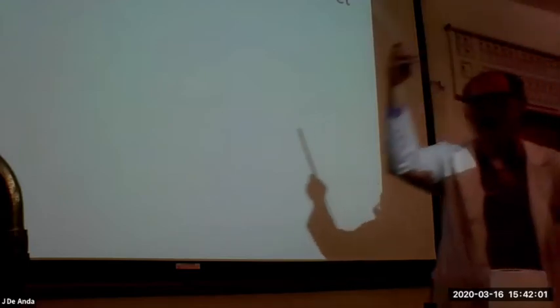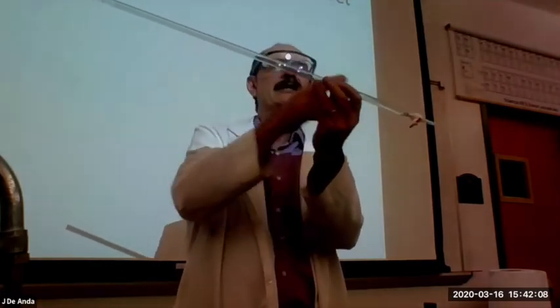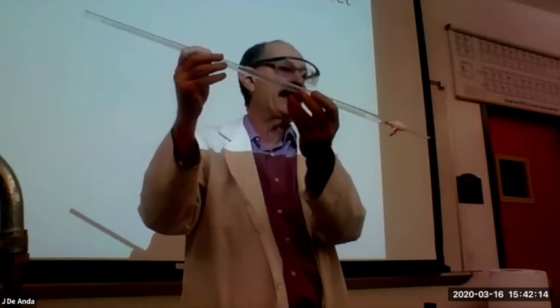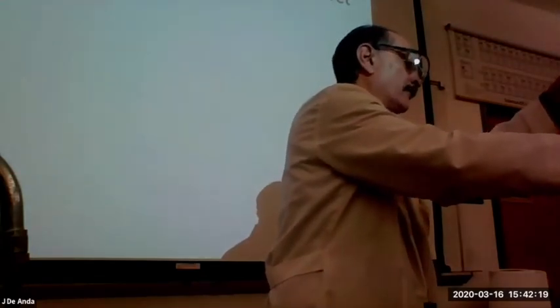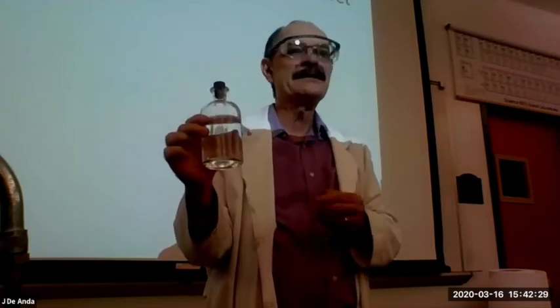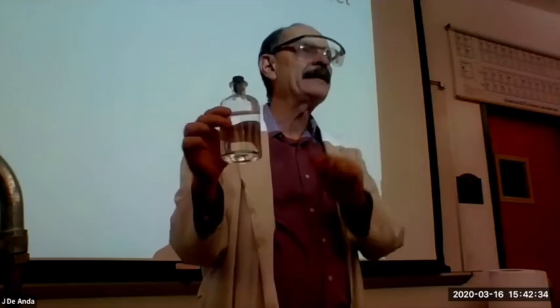So when you retrieve the burette from the window there, it may have a few drops of water in it from when it was rinsed. So we need to condition it. We have to make sure that the only thing that's in here is our solution, which is going to be our KOH. So you're going to go to the shelf over here, and grab your bottle of KOH that you prepared last time. Remember, we figured this is approximately 0.5 molar, but we want to know exactly what it is.